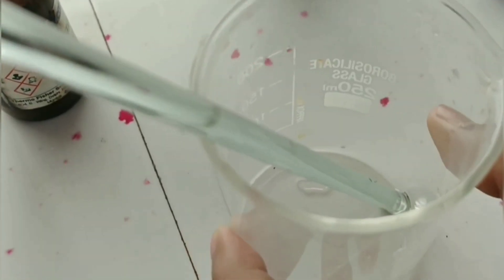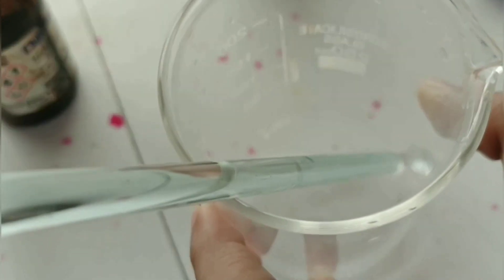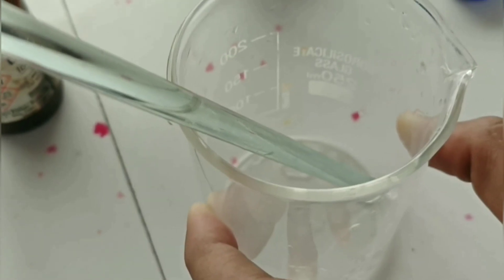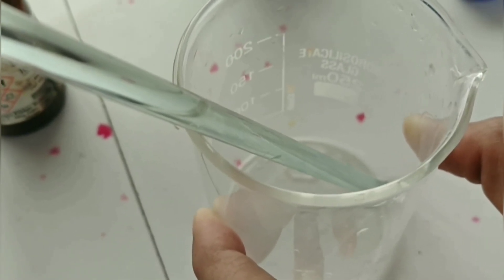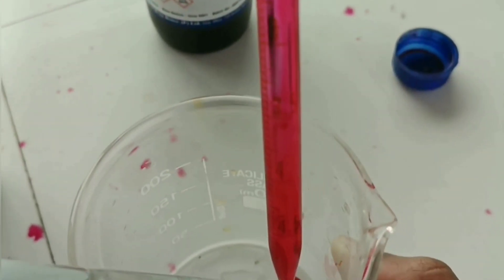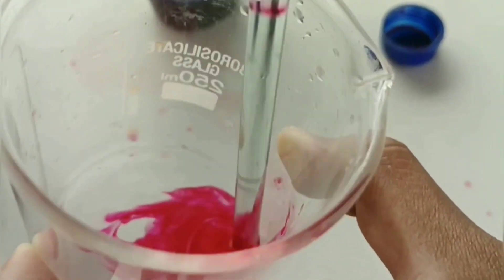Now mix it properly with the help of glass rod to form a solution of phenol glycerin. And add 0.1 ml of amaranth solution in it. Now mix it properly.